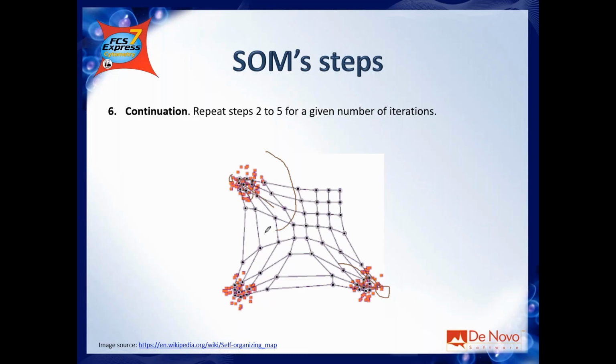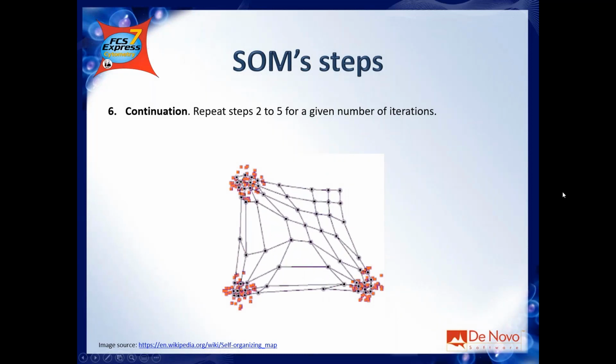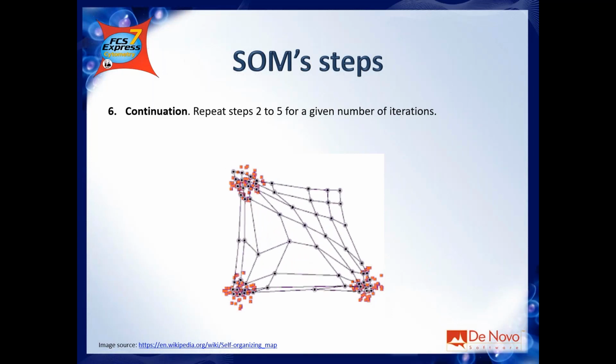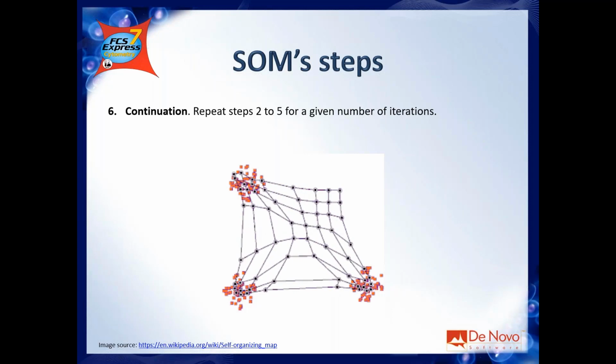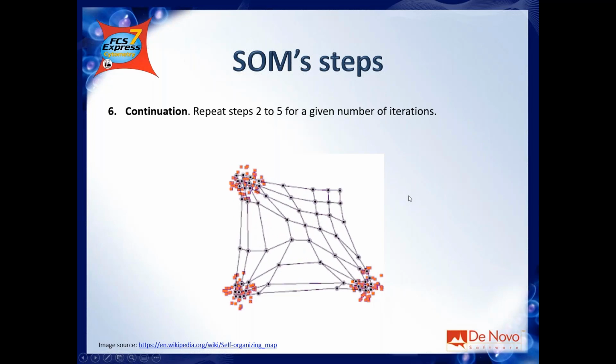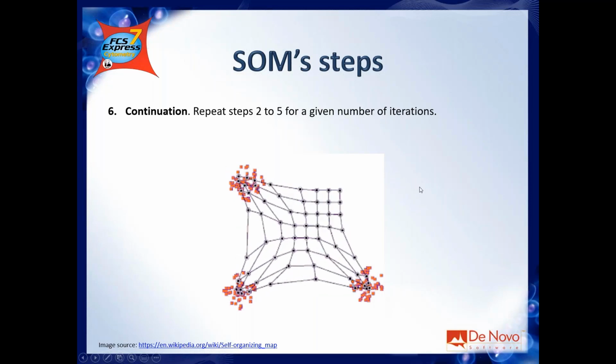And you see that those nodes move more. They cover longer distance than the nodes here, because the nodes here are far neighbors, let's say. And you can also see, now I will start the animation, that this node is too far. It will not move at all in this animation. So again, in this case, you have 3 populations in 2 dimensions, but in your case, you will have, I don't know, 10 different populations, 50 different biological populations, in a multi-dimensional space. But the grid is doing the same stuff.